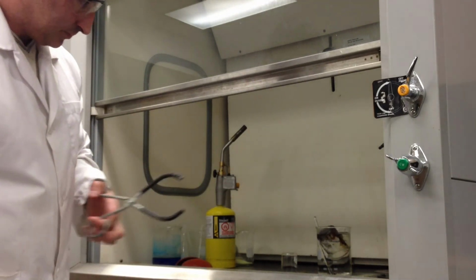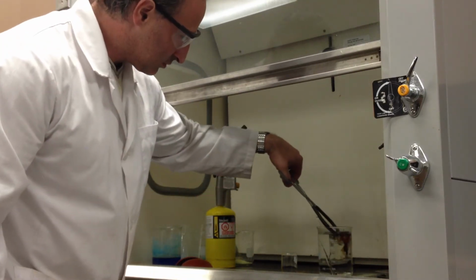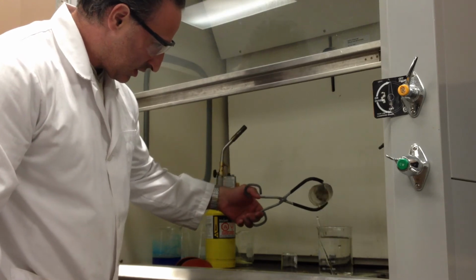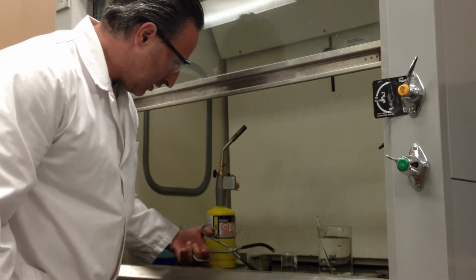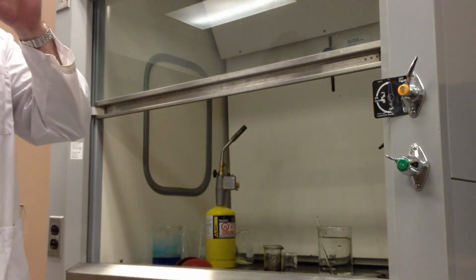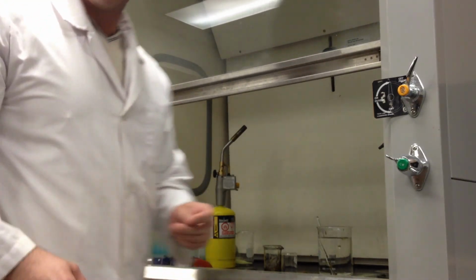Well, there goes that beaker. The effects of thermal shock. It broke. I cooled it too rapidly so it cracked. Oh man. At least the fire's out. Yay.